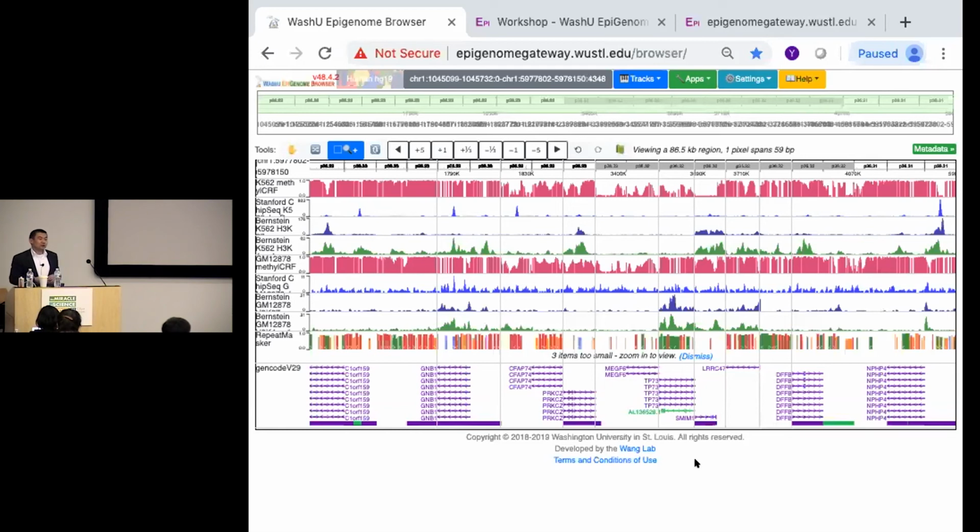One thing you probably run into very often: if you have a bunch of regions, say 200 promoters, I want to generate a profile, stacking up all the promoters together. You can see the promoter is lowly methylated with high K4 trimethylation, things like that.